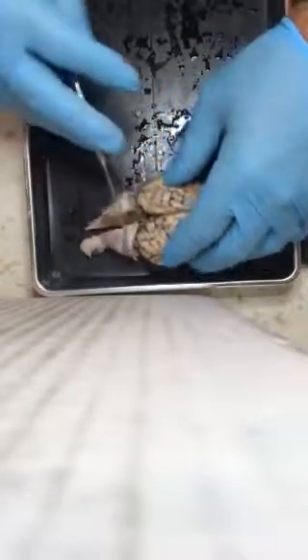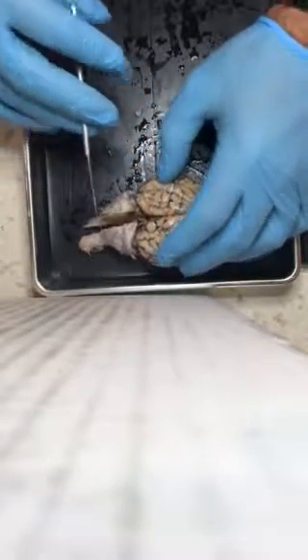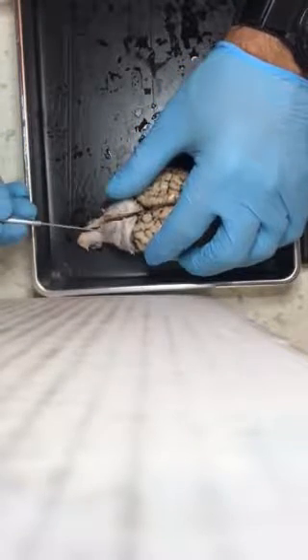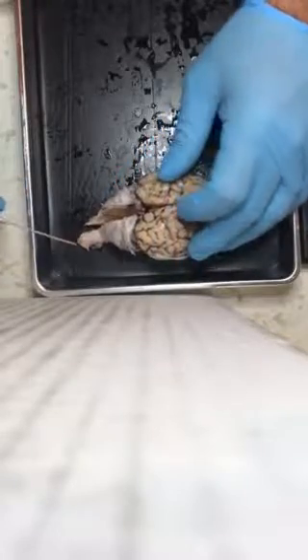And the cerebellum, similar to the cerebrum, the cerebellum is going to be back here. This is the cerebellum, and it also has the two lateral hemispheres. So these are the two different lateral hemispheres of the cerebellum.